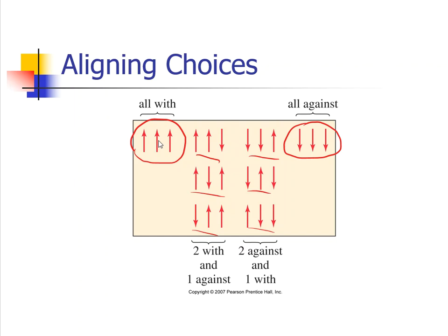So what you're seeing here is that there's more options for these, right? We've got more variations, more possibilities. If all of them are with, there's only one possibility. So we typically see a very short signal in the beginning with that. However, if 2 of them are with, it's going to amplify that main signal. And there's more choices here to do that. There's 3 choices versus 1. So that signal will be a little bit higher because of that. So that's why we see the heights the way that we do when we look at splitting of a major signal.